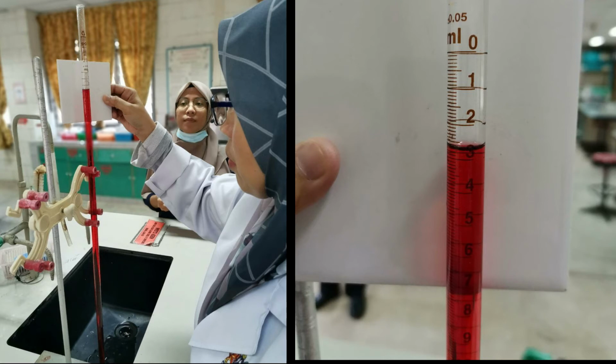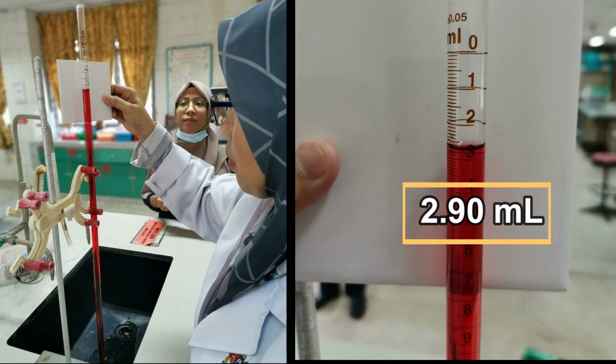To measure the volume of the solution, make sure to read the level at the bottom of the meniscus at eye level. Record the initial reading to two decimal places. The initial reading does not necessarily have to be exactly 0 milliliter. Any value below or near 0 is accepted.